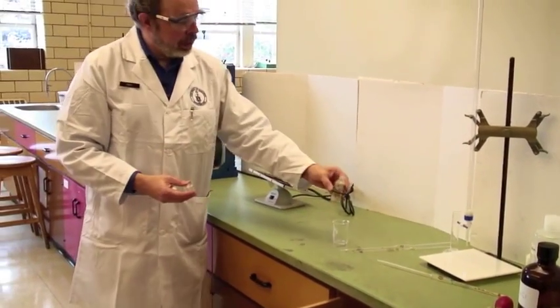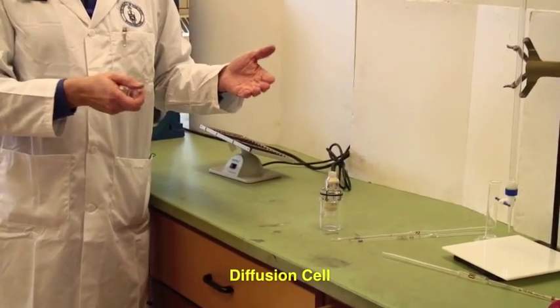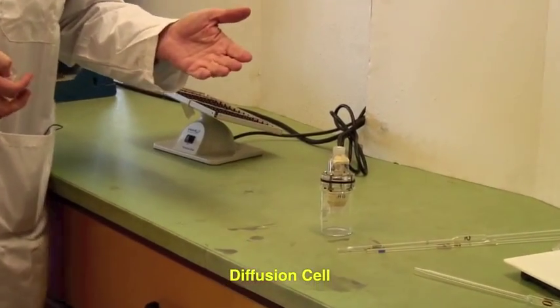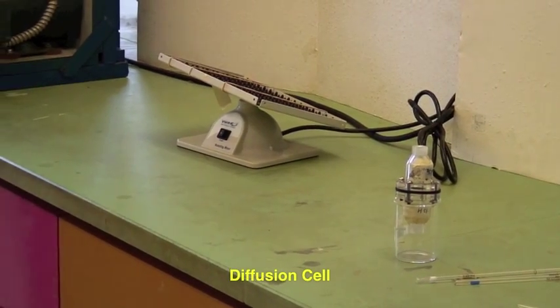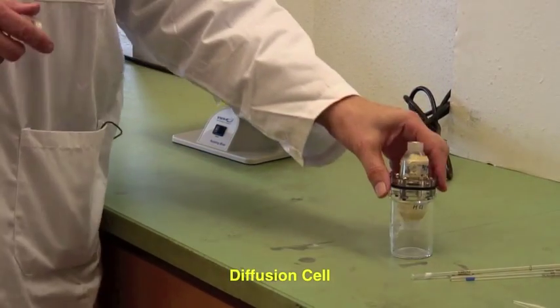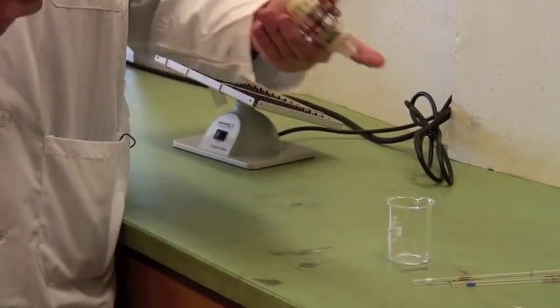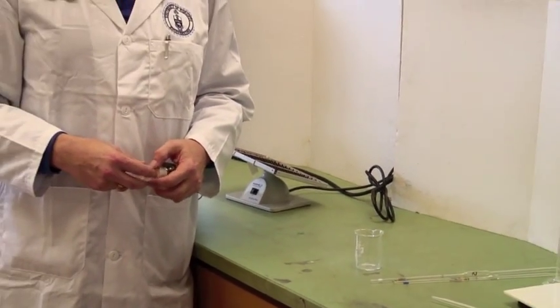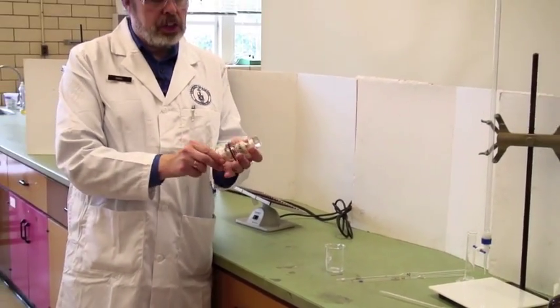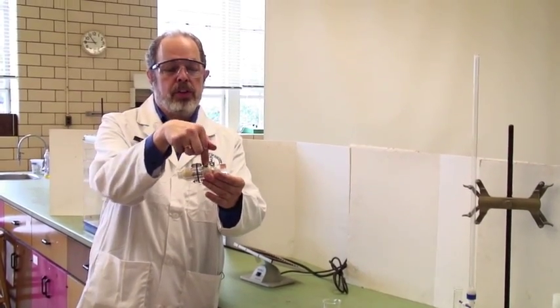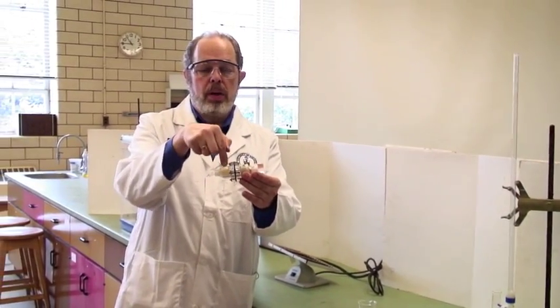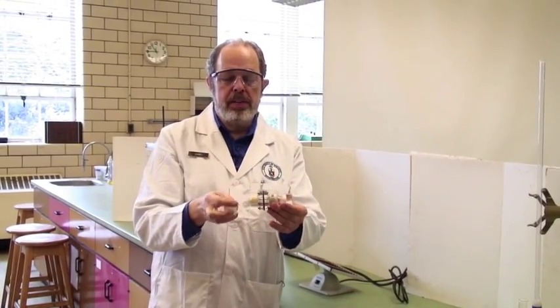You will be filling them with material, and then you'll be agitating them. We've got a plate agitator and a mechanical agitator here, and then you'll be analyzing the results of how fast material moved through the membrane, which is actually in the middle of this here. There's one compartment for one solution here, one compartment over there, and the membrane is in the middle.